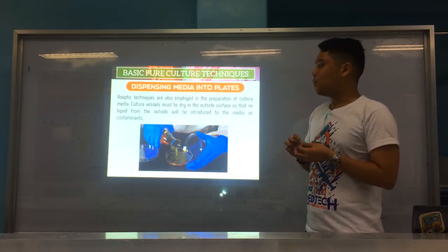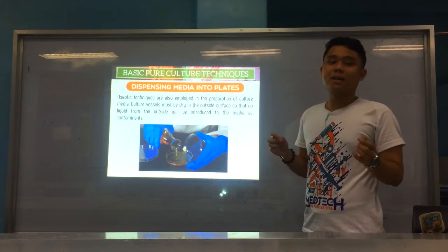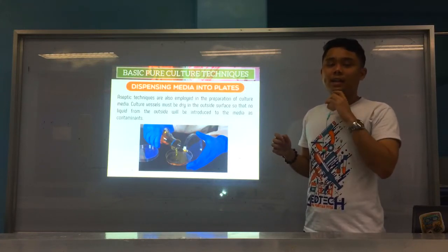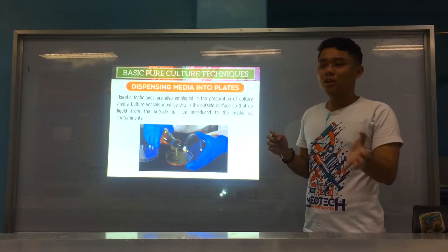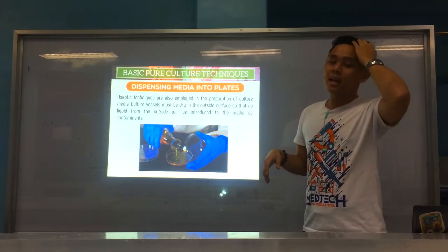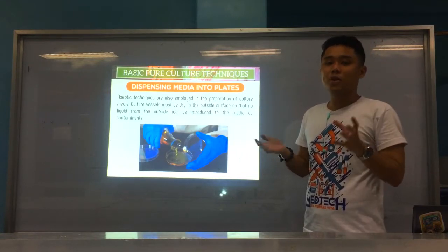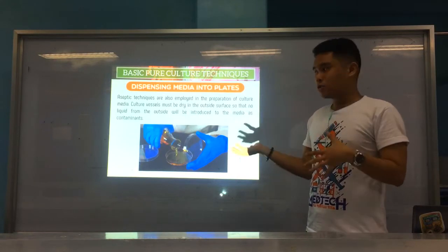That is why we want to make sure that we always work near the flame. Actually, it's a rule of thumb in bacteriology that you always need to work near the flame if you're not working in a BSC, like on your countertops, not tabletops. Because again, this would limit or prevent the introduction of contaminants in your culture and culture media.